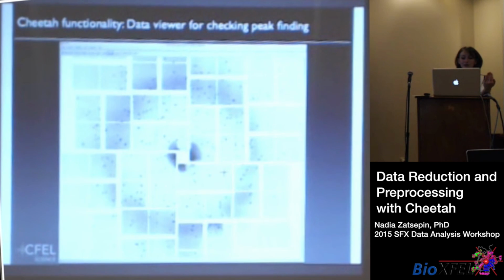So the number of spots you will see from each crystal is smaller than if it was on a goniometer. The bandwidth is smaller. But the other point is we do not rotate the sample. The pulse is so fast that the motion is frozen. Not just the motion of the crystal, I mean the motion of the molecules, the atoms inside is frozen in those 50 femtoseconds.